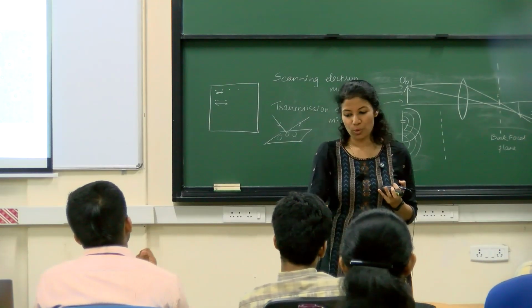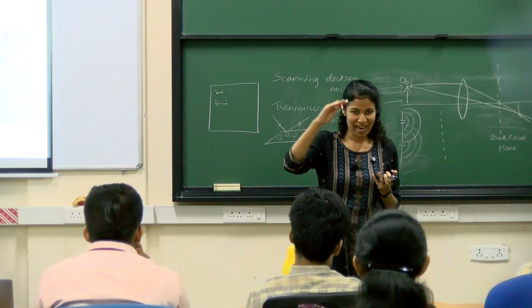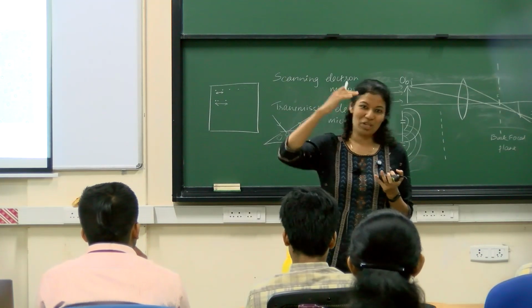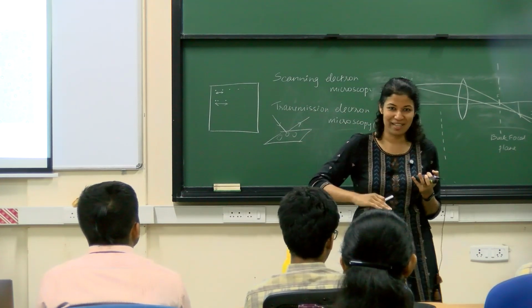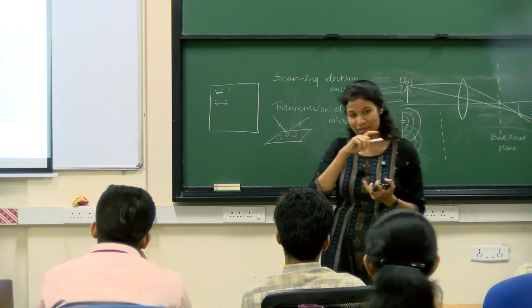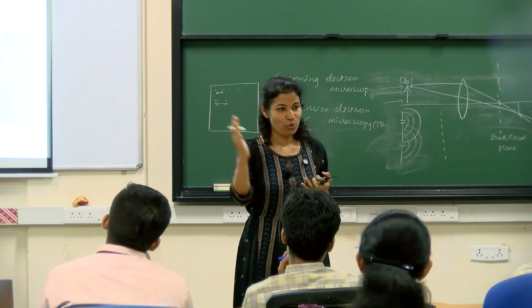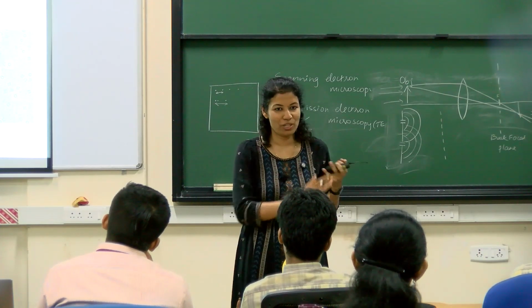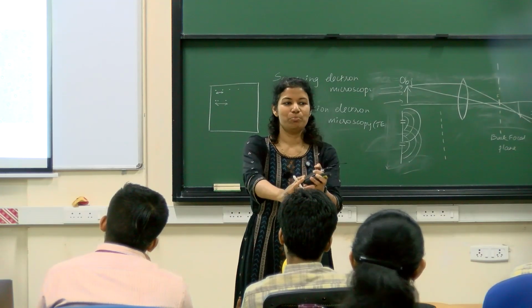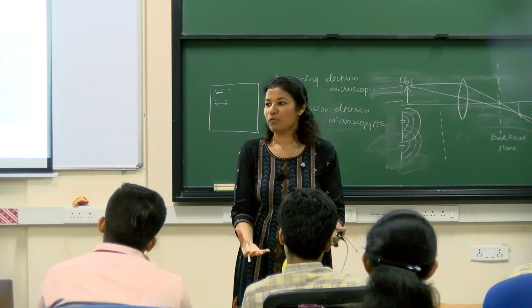But with light also you can do this kind of method. With light it's easier to just do a Z-stack, as they say. Because at that stage you can section at different levels and you can get that information. But with electron microscope, you can't do that. So you do projection, and then you do what's called back projection, and then you can get the 3D volume from that.